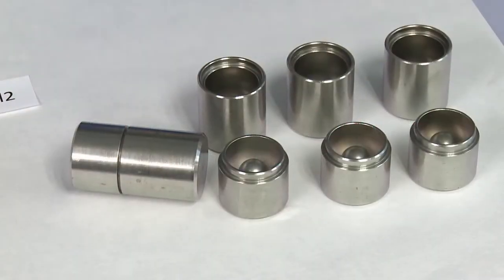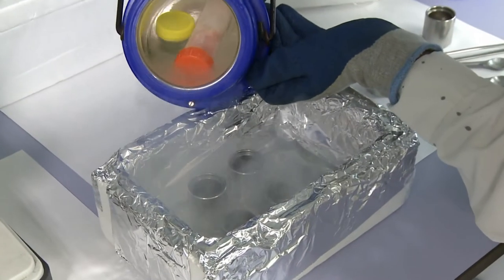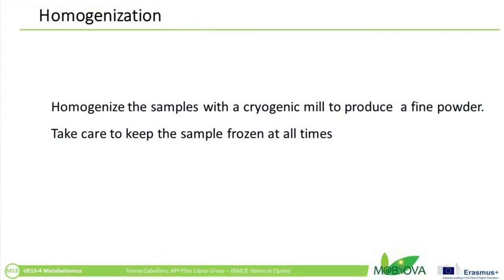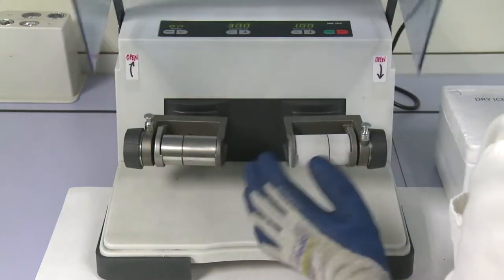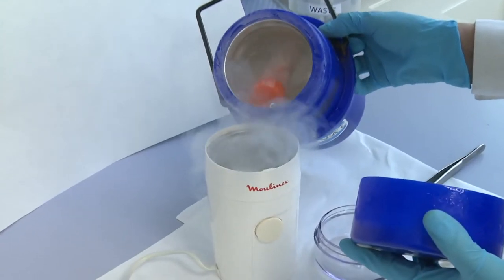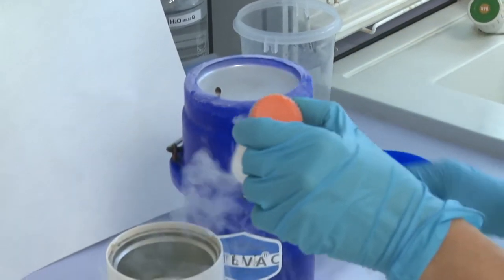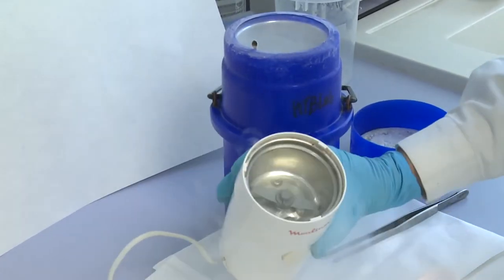To homogenize the samples with the tissulizer, you have to pre-cool with liquid nitrogen the capsule and the bowl needed. Then we will put the pieces of tomato without losing the freeze at any time. Grind for approximately 1 minute and at a rate of about 30 strokes per second. Or according to the laboratory facilities, you might use a previously chilled coffee mill, especially suitable when a large sample quantity is available.